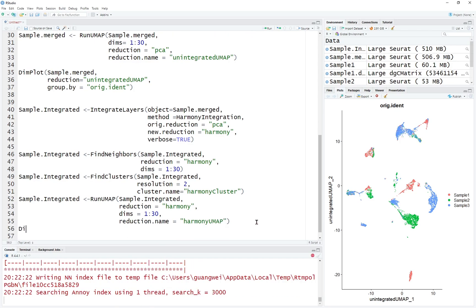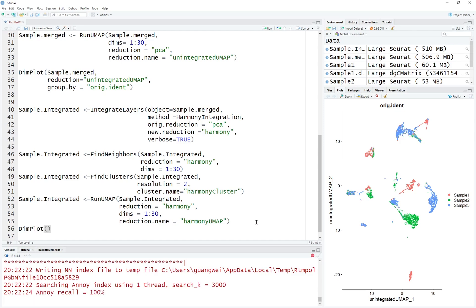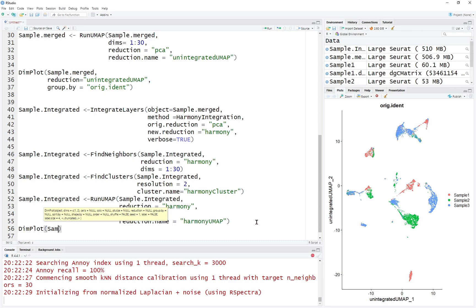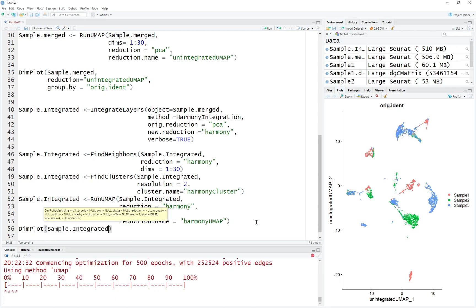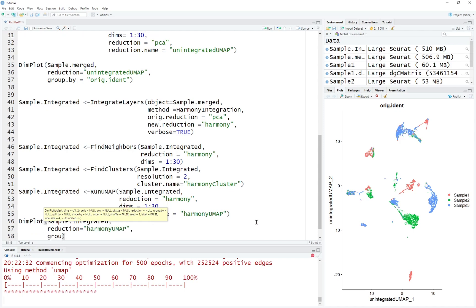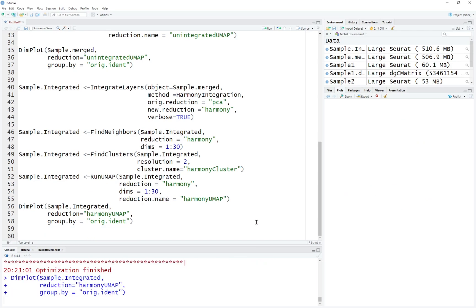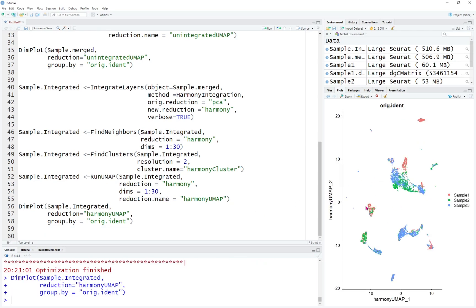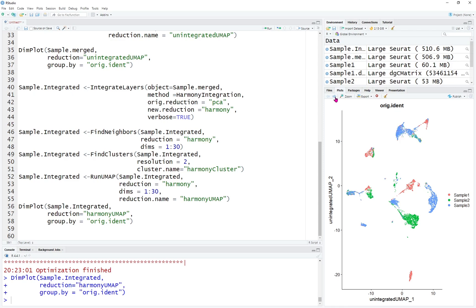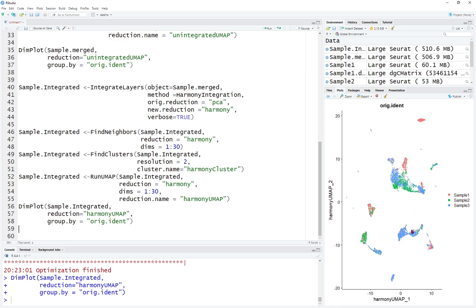Let's run this. Now we can do the DimPlot again to visualize the data. The input will be sample integrated, the reduction is called harmony UMAP, and we're going to group them by original identity. You can see for each cluster we have fairly integrated data. Some clusters are much closer to each other compared to the previous unintegrated plot, and clusters now have data from all samples.